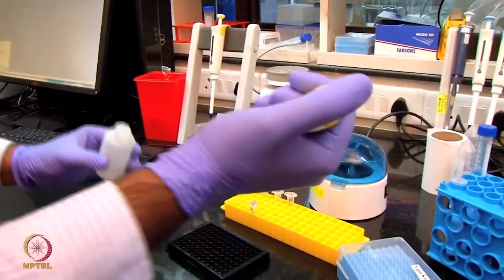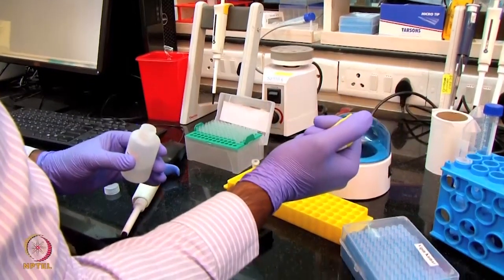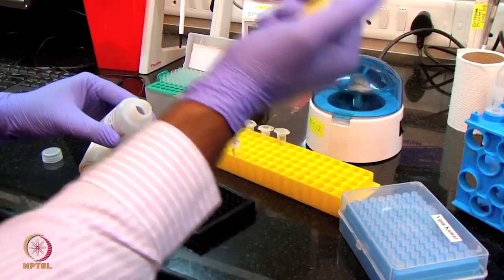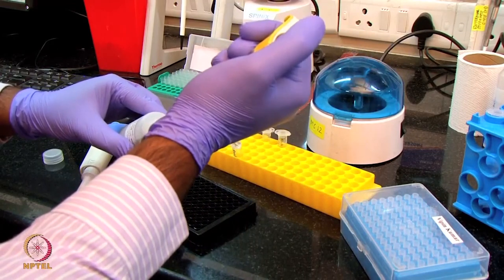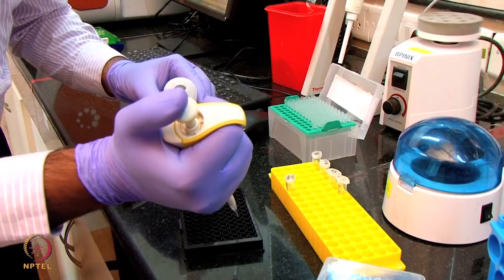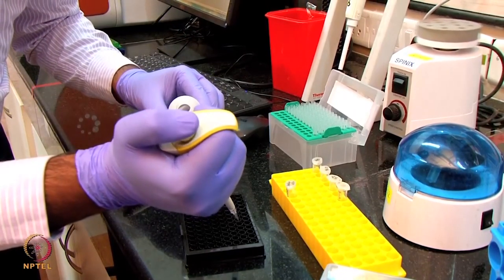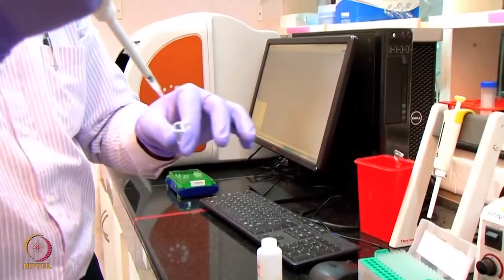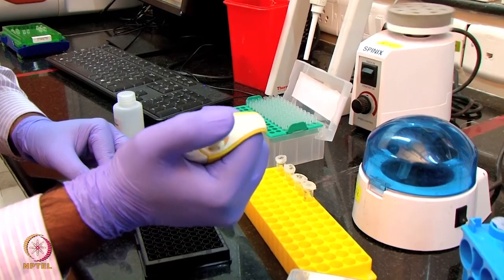Here I'm going to use around 6 concentrations, with 2-fold dilutions. So I will add buffer here. I'm going to do the dilution in the plate itself. 200 microliters each of the sample diluent buffer I'm placing in the 6 wells of the 96 well plate. And I'm going to use 3 wells as references. This plain buffer is used as a reference. Here, this is the 50 microgram per ml protein. I'm serially diluting, doing a 2-fold dilution in the plate.